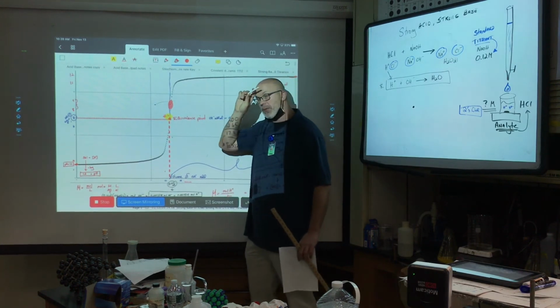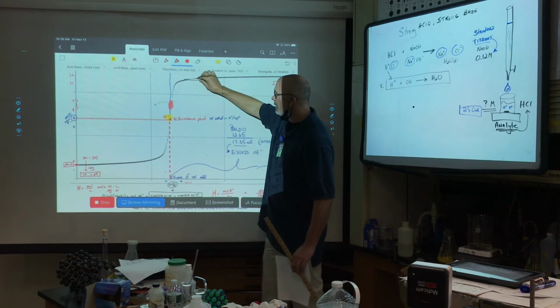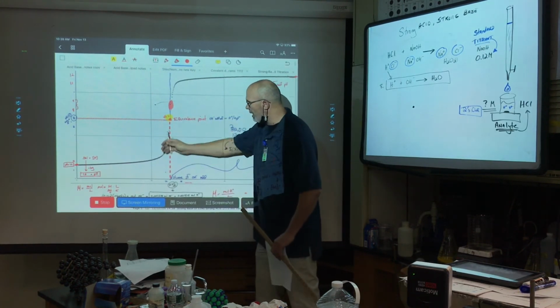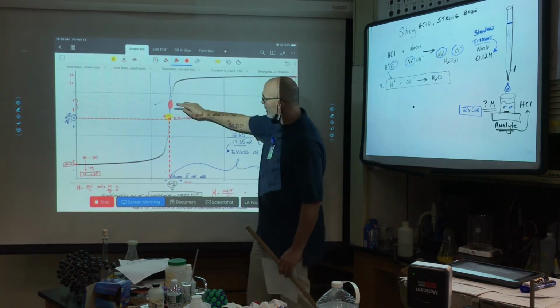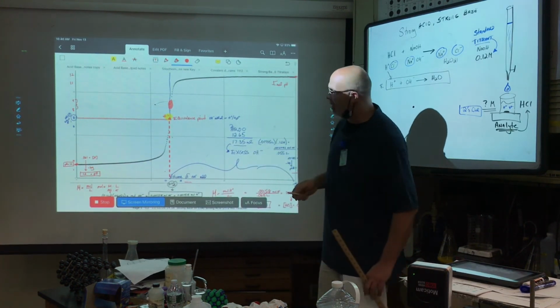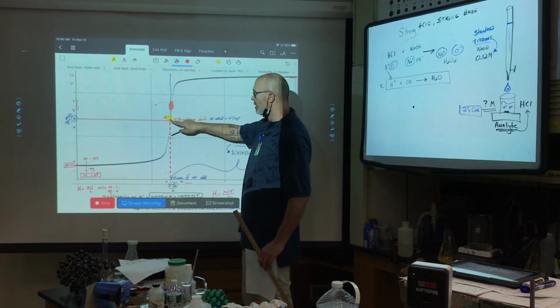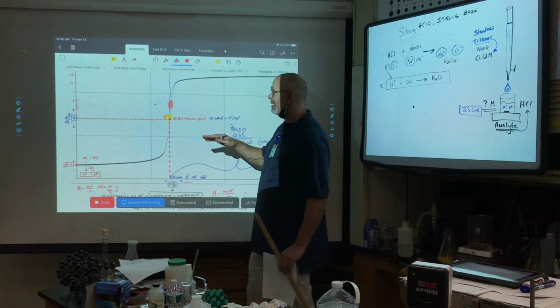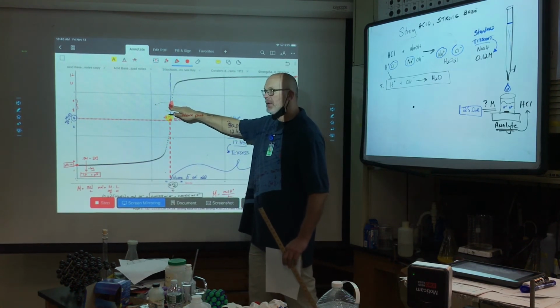We're going to see some titrations, like the second one you will be working on from here, where this asymptote is going to be shorter. And so you have to pick an indicator that's on this line. Of course, the best way to pick the best indicator is to pick one that has a pH color change that's closest to the equivalence point. We're going to learn that its own pKa is what we look at here.